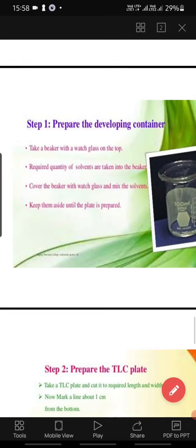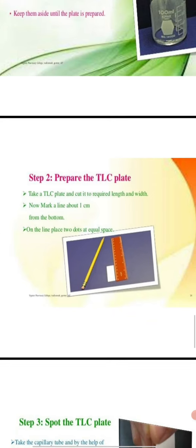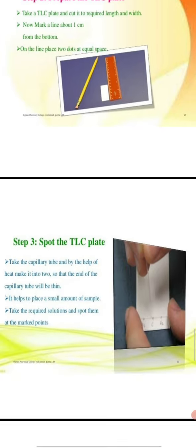In the next point, prepare the TLC plate. Take a TLC plate and cut it into the required length as well as width. Now mark a line 1 centimeter above the bottom, the baseline. On the line, place two dots at equal spaces.